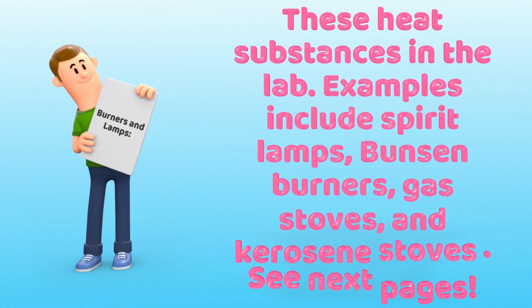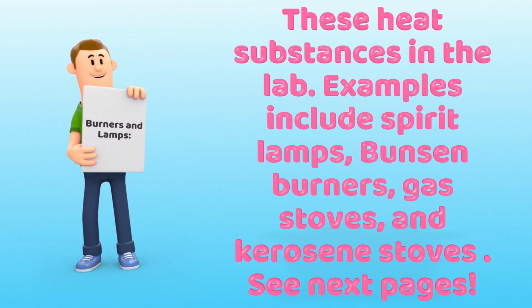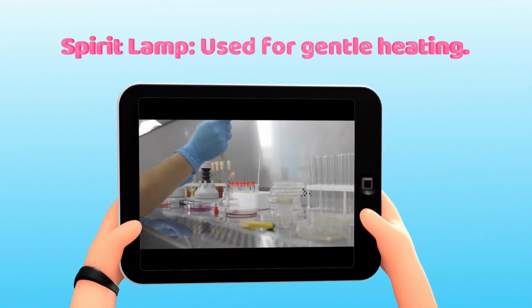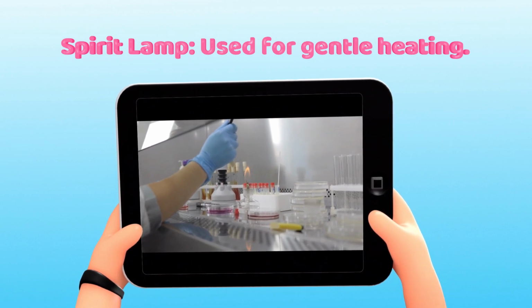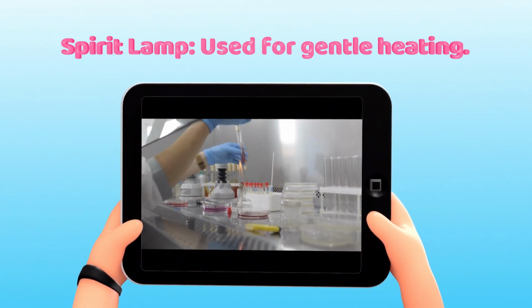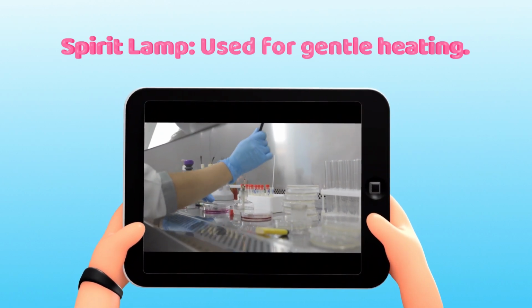Let's now see burners and lamps. These are usually used for heating substances in the laboratory. Examples are spirit burners, Bunsen burners, or gas stoves. The first type of burner is the spirit burner. This is used for gentle heating in the laboratory. As you can see from the screen, that is how it is used. It provides heat when heating some substance in the laboratory.